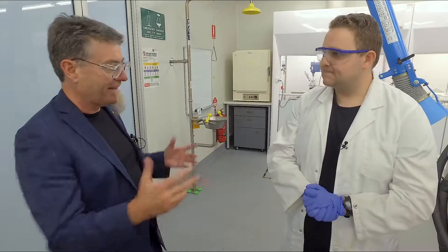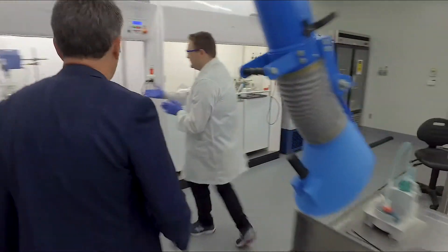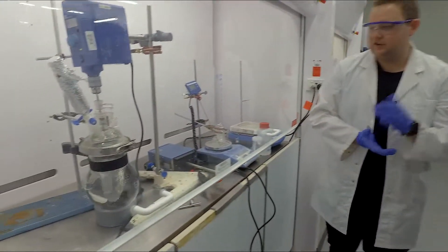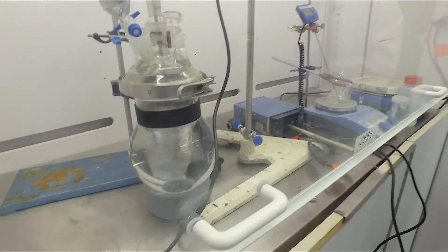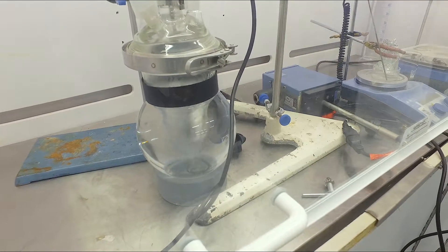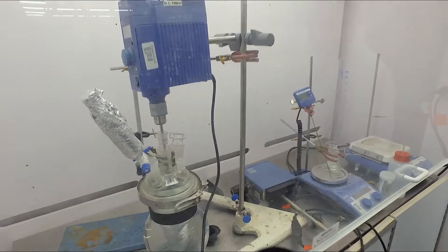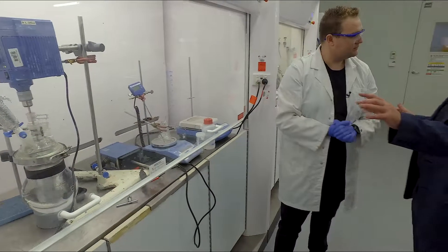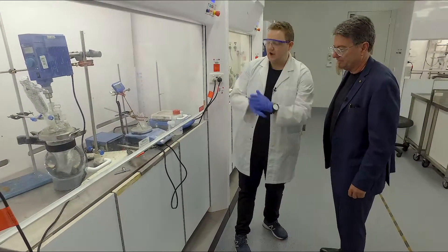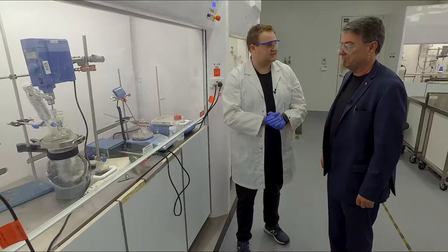And then you would start to do whatever reactions you need to do to turn it into the Bio-Ink. We start off with these smaller scales. This is a good example of a reaction that we would particularly do over at AIM. Taking the results from this, we would hope to achieve similar results in the large scale reactors. What sort of quantity of material would you be generating from a reaction of this scale? In this scale, you could obtain 20 to 50 grams.